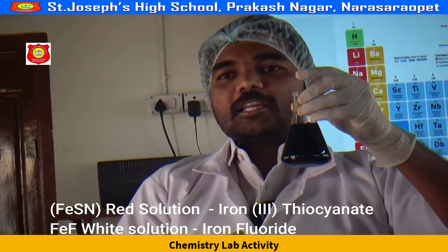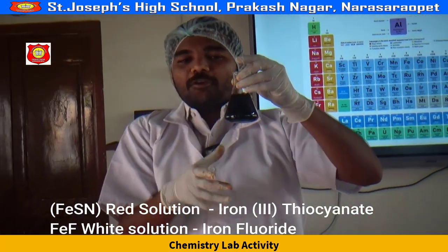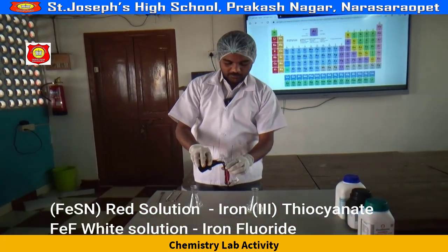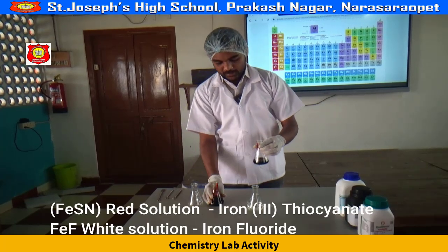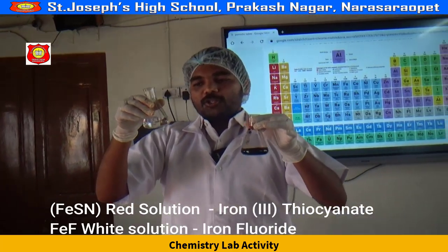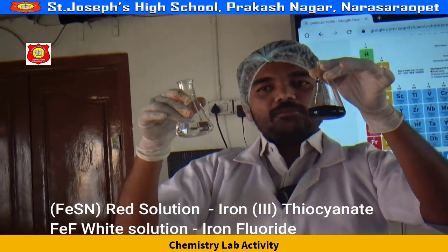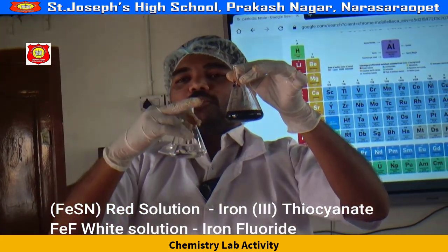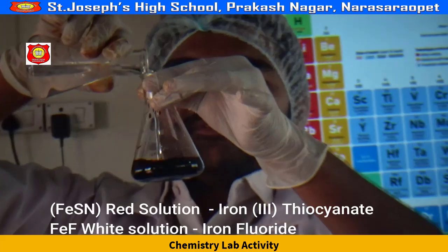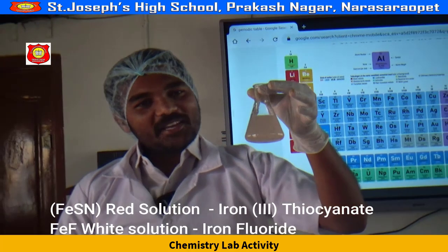But now, is it possible to make the solution transparent like before we added all this? Yes, possible. The solution is too heavy in this conical flask, so we'll take it into another one. This is already prepared sodium fluoride solution. When we add this sodium fluoride solution to the solution combined with potassium thiocyanate and ferric chloride, is it going to disappear? Isn't it? We'll see. Demonstration complete.